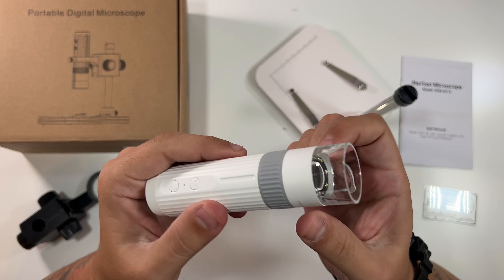I've never used a microscope in my life, so I'll review the manual, put it all together, and show you how that goes. We've now put together the portable digital microscope. The next step is to plug in the cable into the Mac. On a Mac this actually uses a default program called Photobooth — open it up and it defaults to the Mac camera. We plug in the USB adapter and then power on the device.